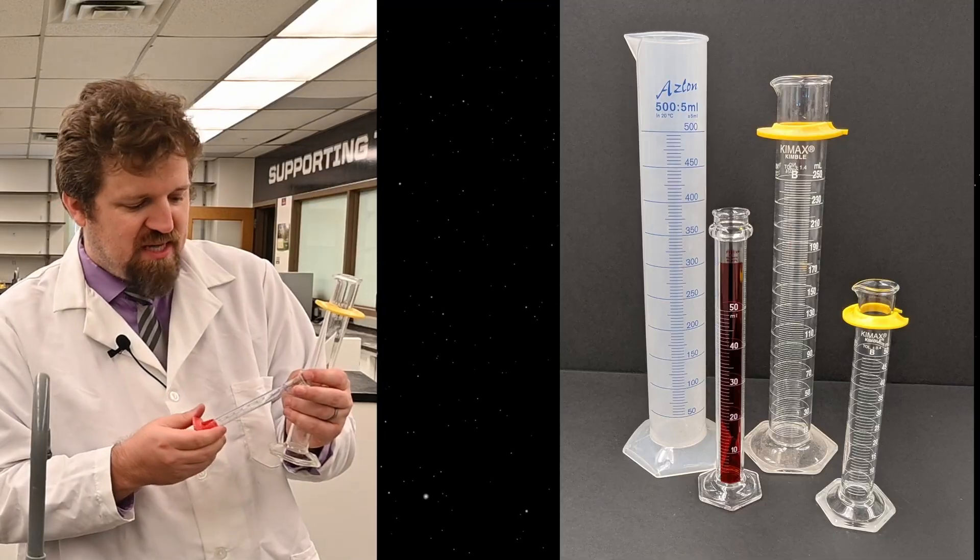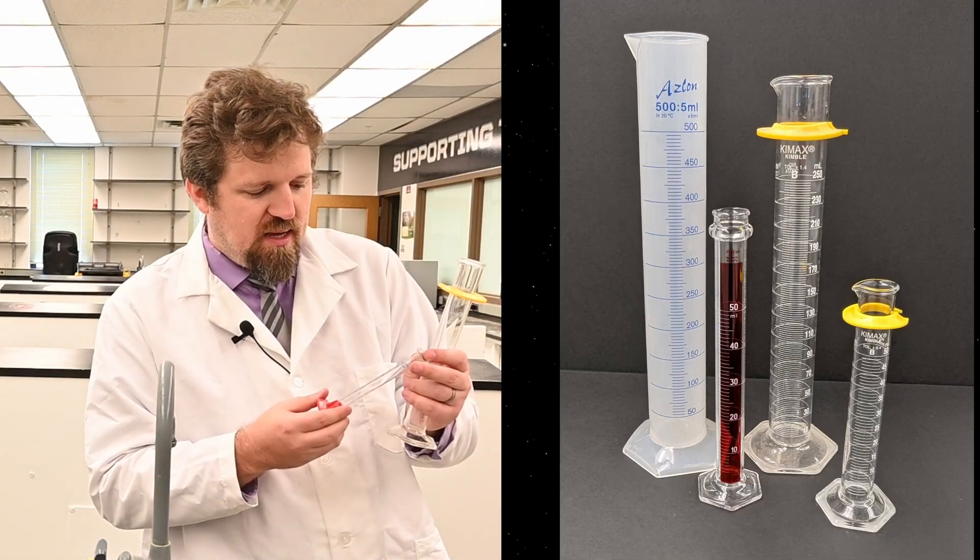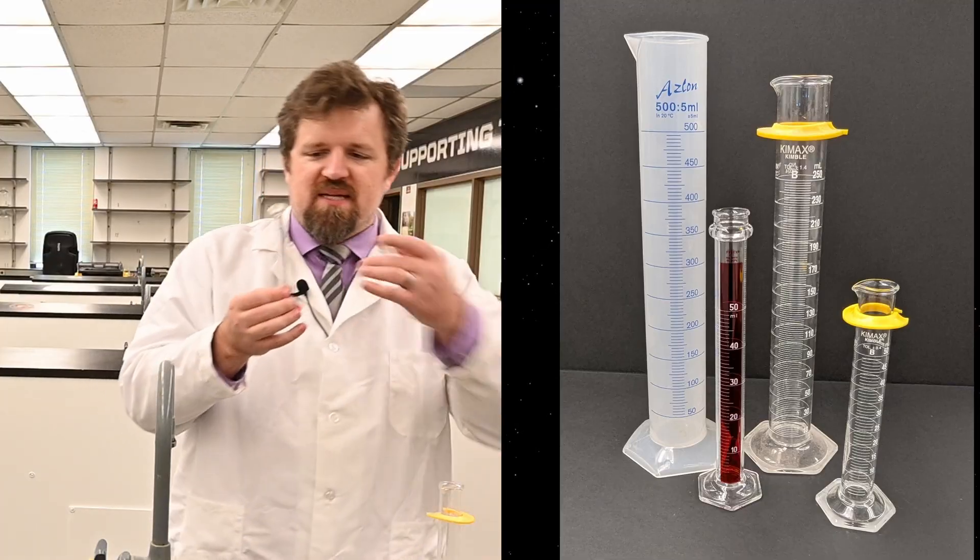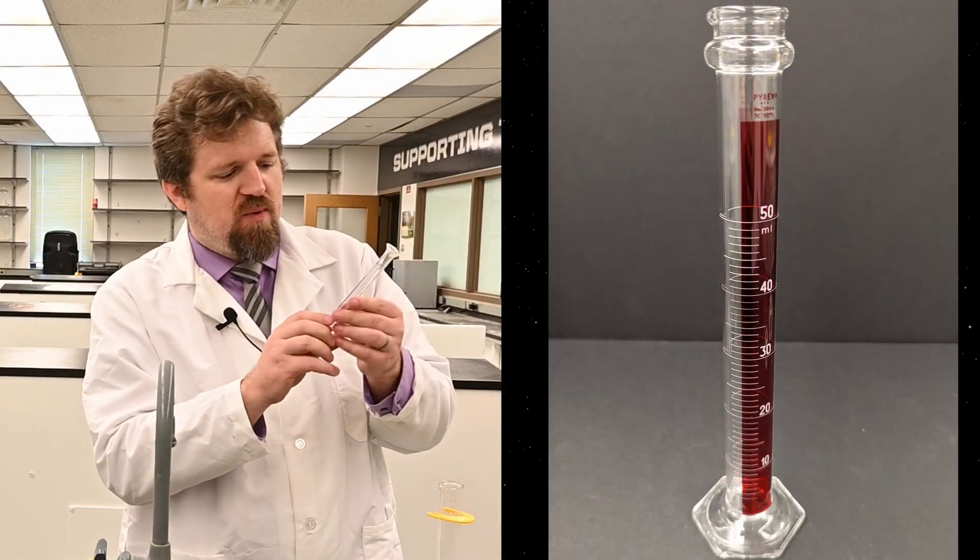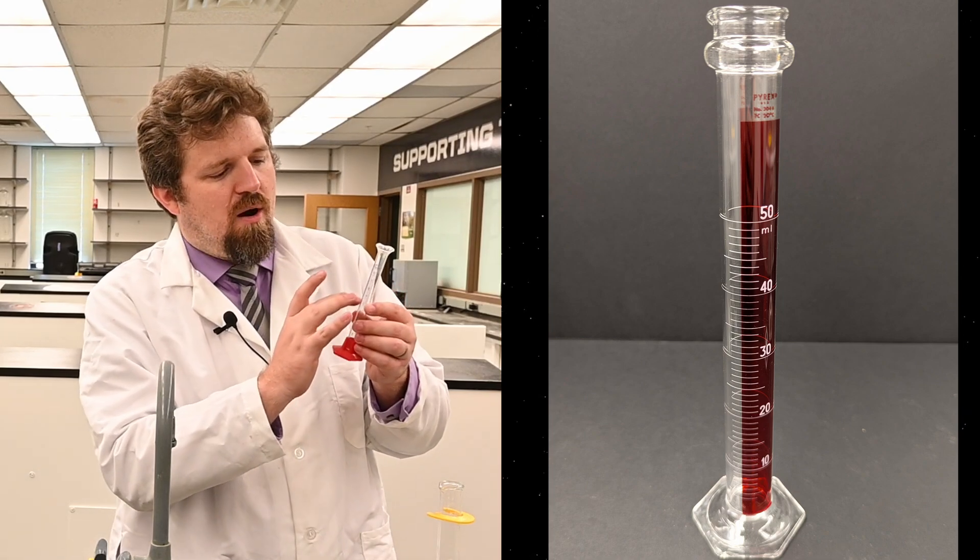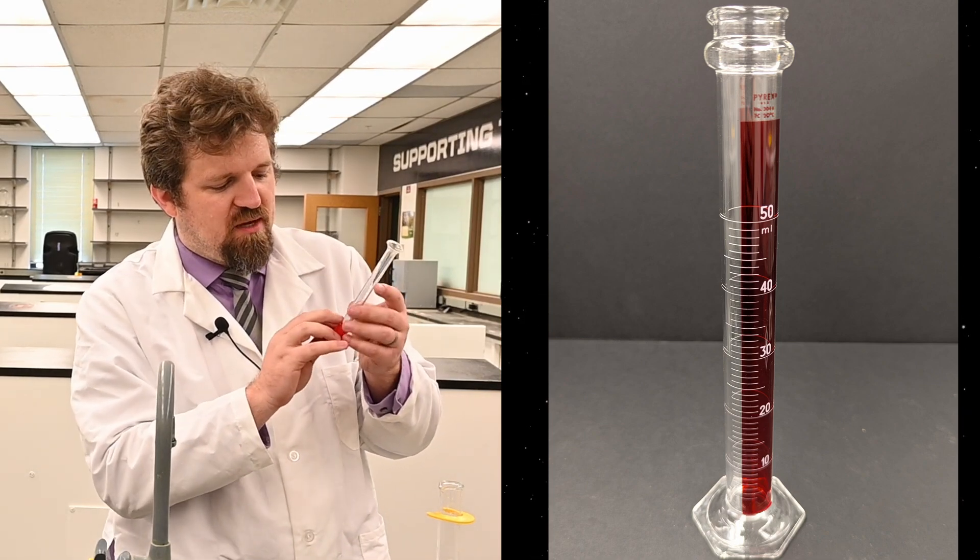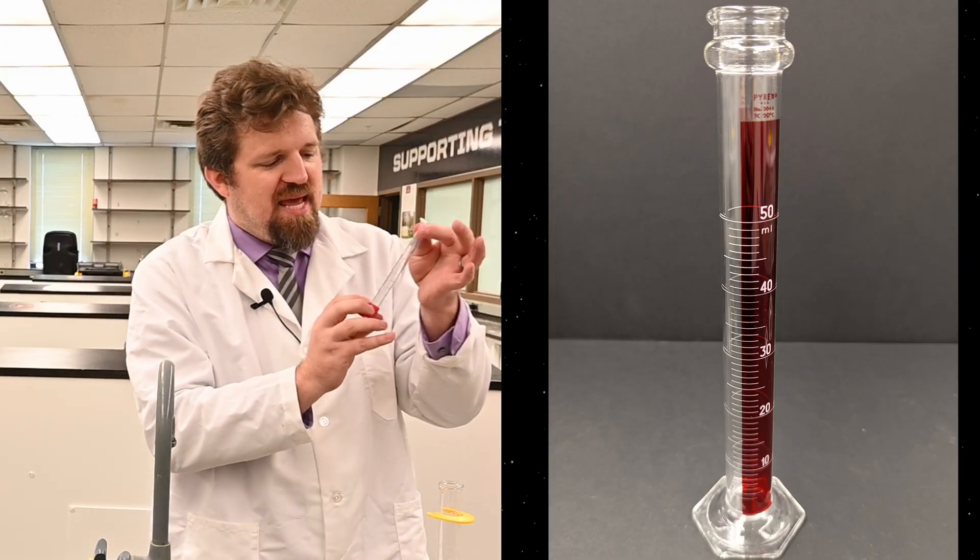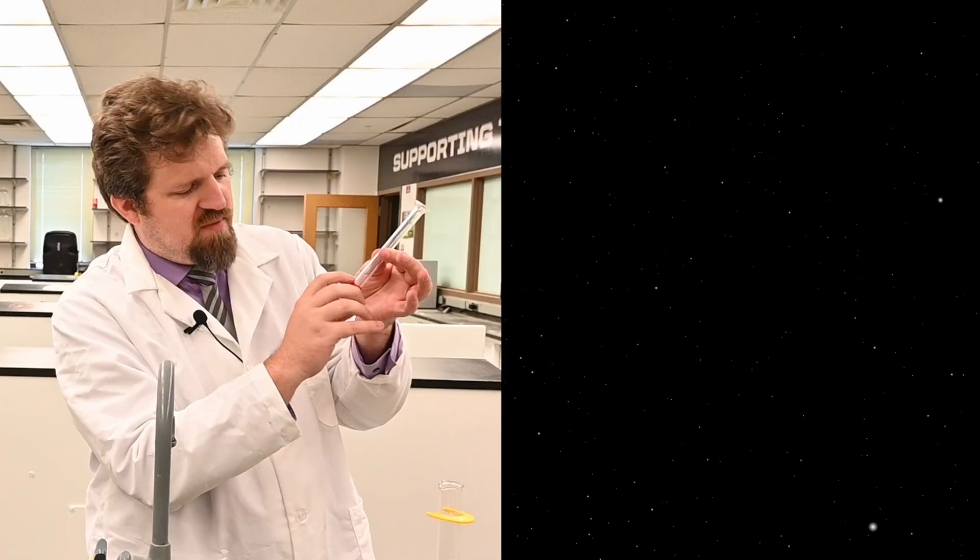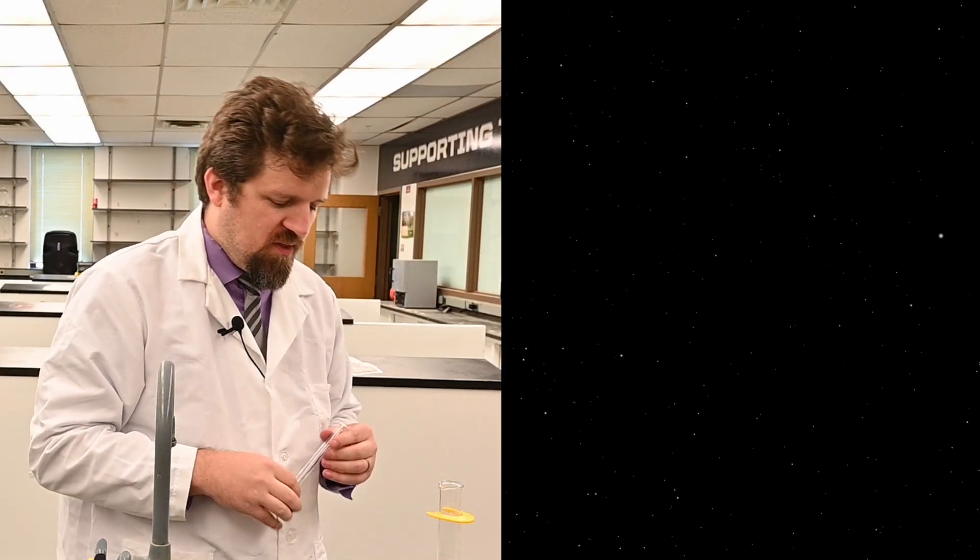Lastly, I think the most precise instrument we've talked about yet is the graduated cylinder. Now, why do they call it grad cylinder makes sense, it's cylinder shape, but why is it called graduated? Well, the graduated cylinder has tiny little lines, lots of lines marked on, all marking a specific volume. In this case, this is a 10 mil graduated cylinder. Every big line is one mil, and the little lines in between are the 0.1 mil.